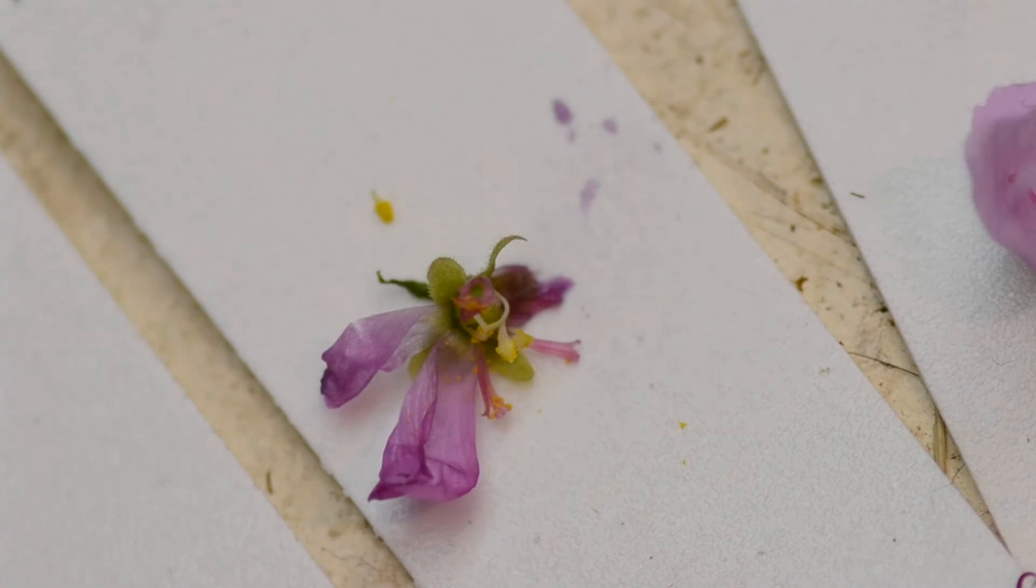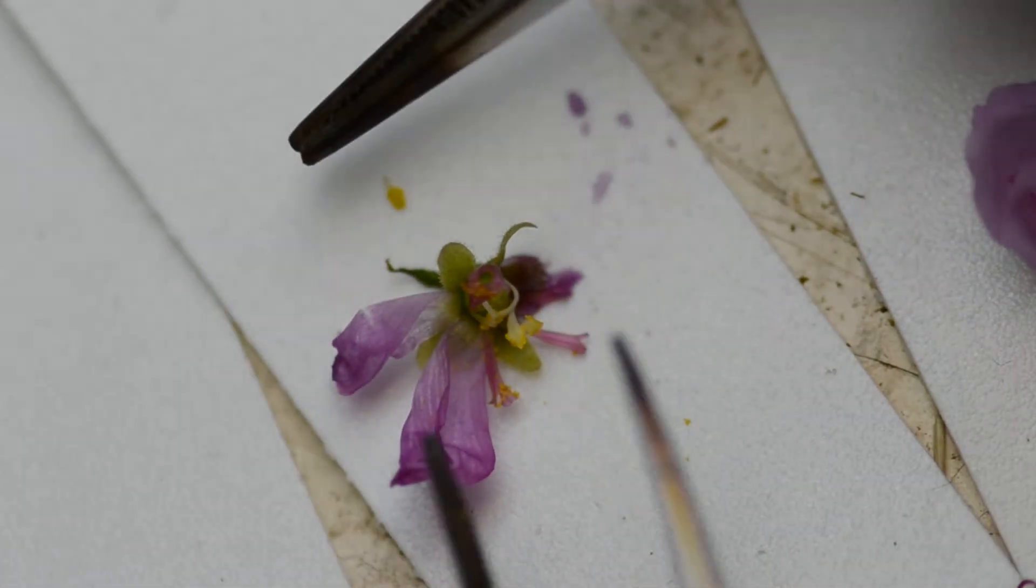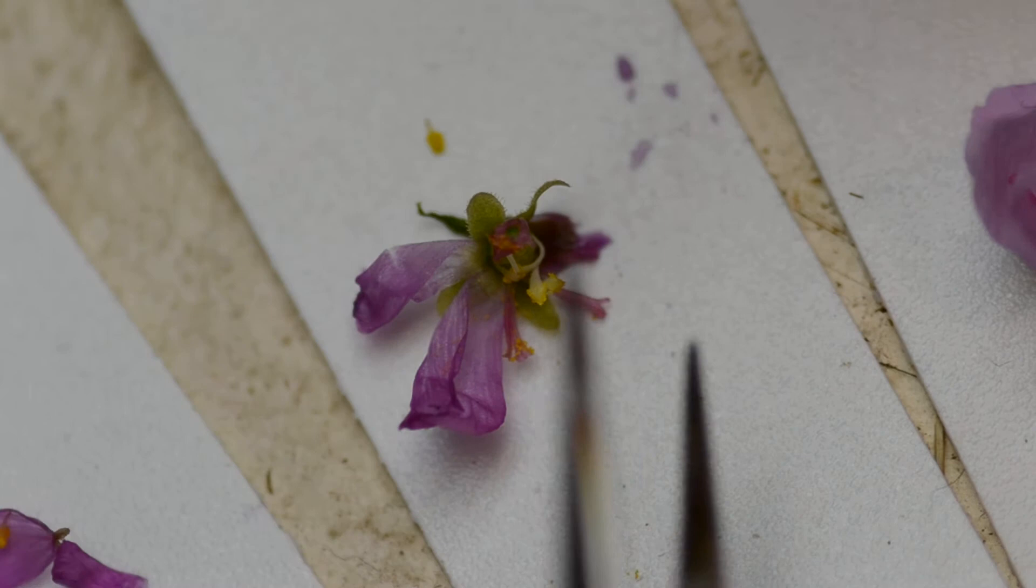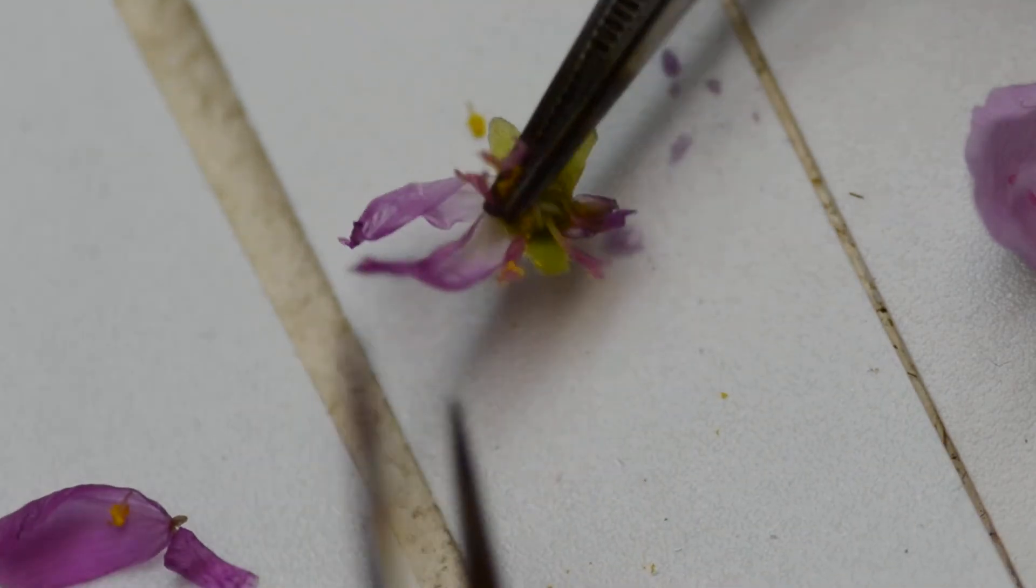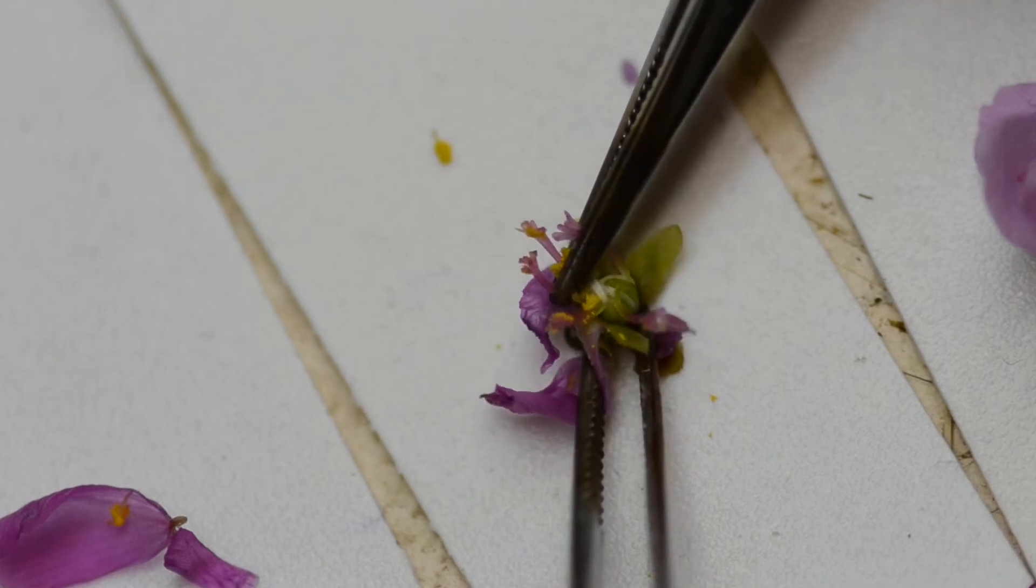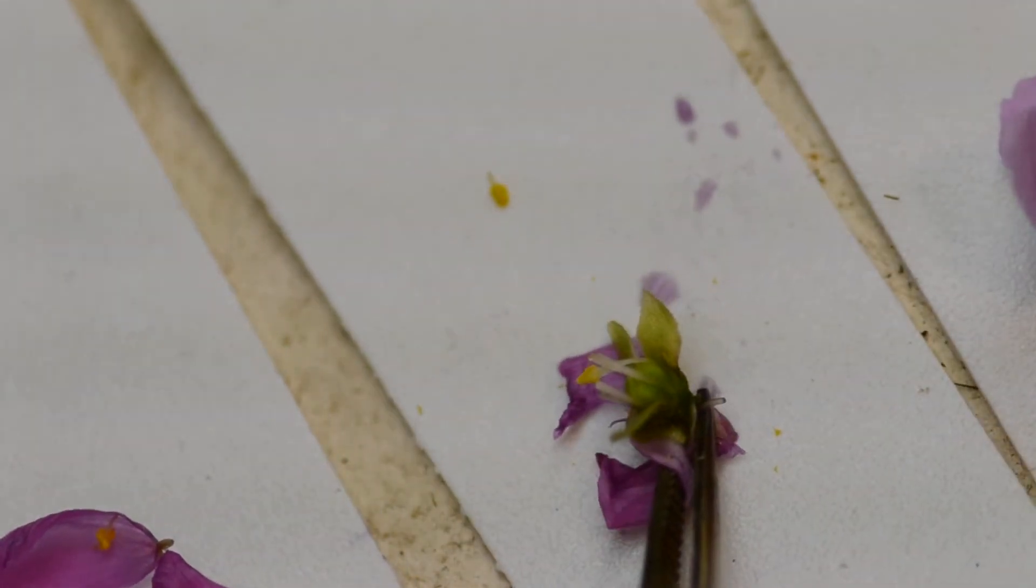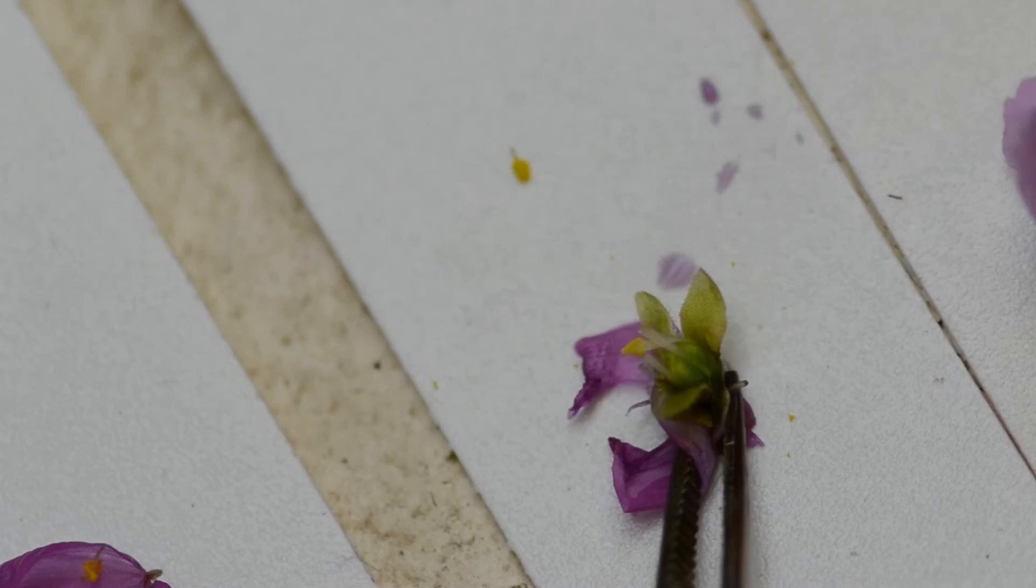Okay, so now if we turn the flower on its side, we expose a green lump. Let's see if you can see it. So the green lump is the ovary.